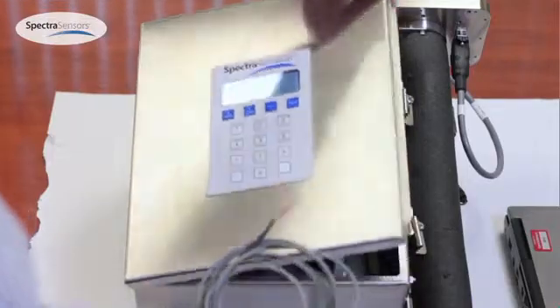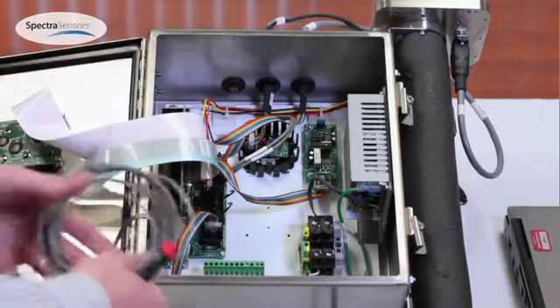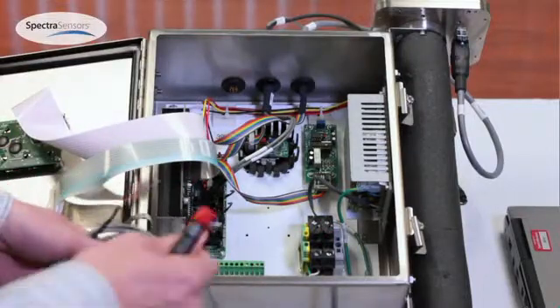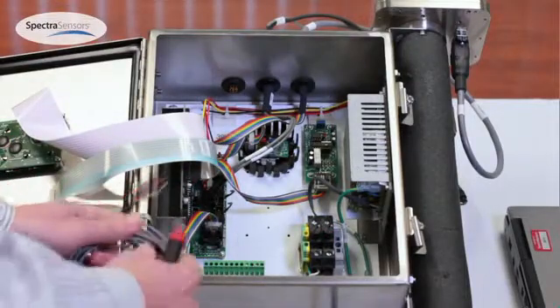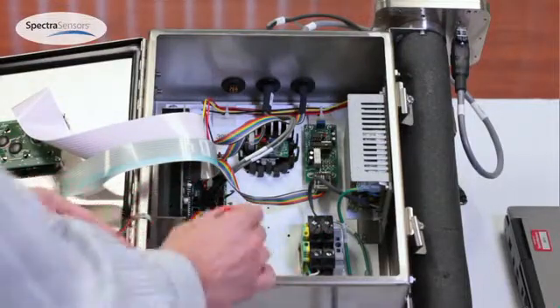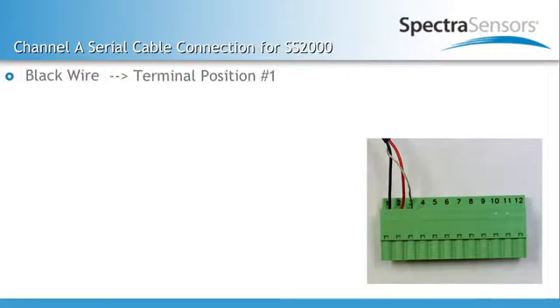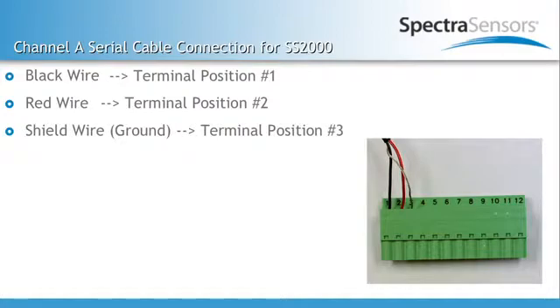To install the cable, access the 12 position terminal block and you're going to use the first three positions. In the first position goes the black wire, the next one is the red, and the last one is the ground.